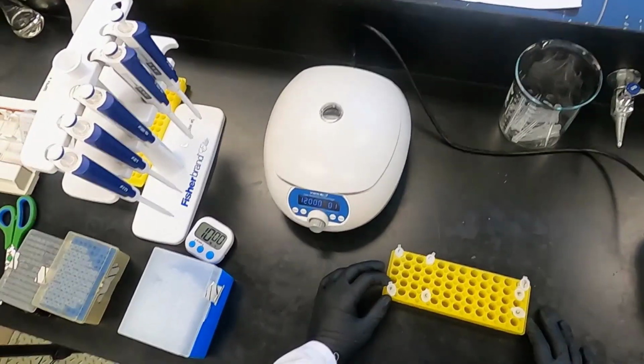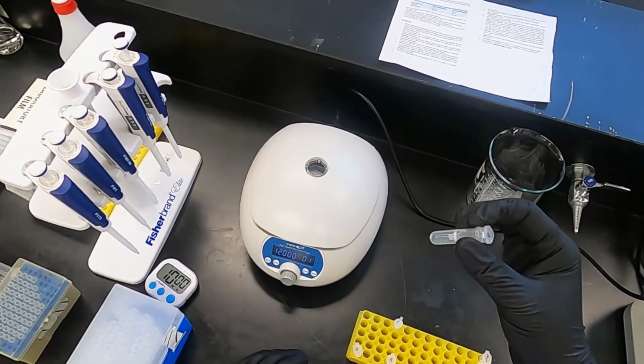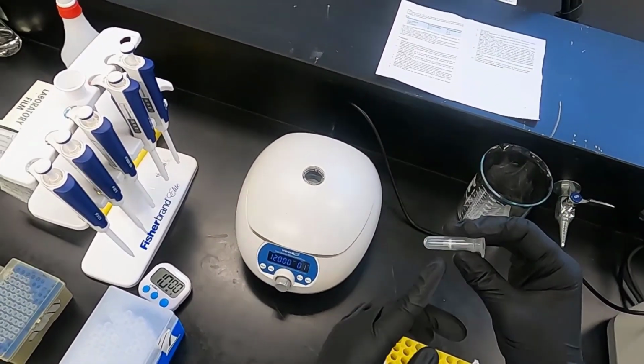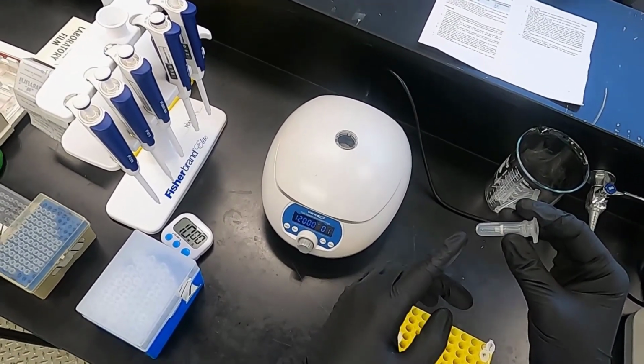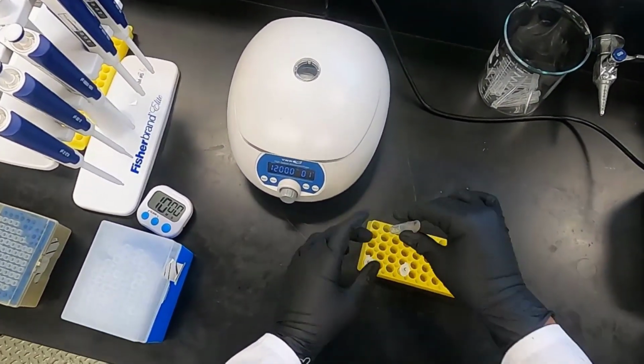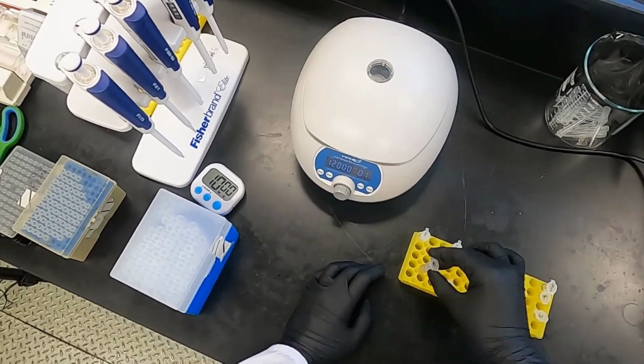Now that we've added the ethanol, we're going to use these spin columns, these DNA extraction spin columns. The column inside is going to catch our DNA, and we're going to use it to extract it. And any of the flow through that we're going to discard is going to be inside this tube. So the first thing we're going to do is we're going to transfer our samples into these.